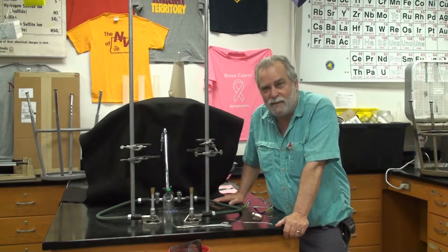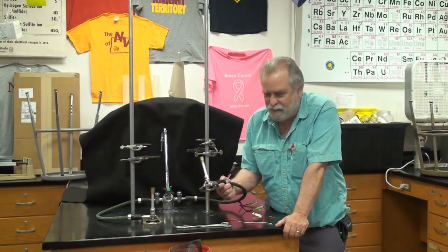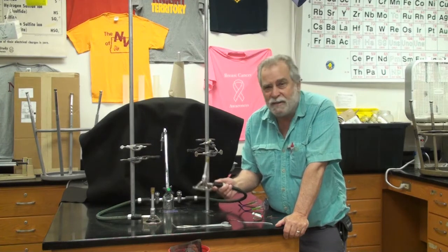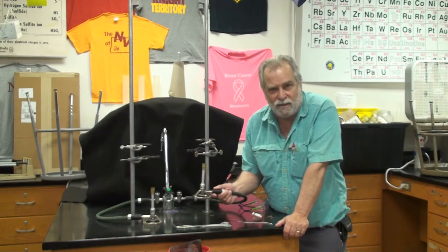Welcome back to chemistry. Today we're going to look at the Bunsen burner. So the Bunsen burner is this device here, and we'll use it to heat up different solutions or different chemicals to cause chemical reactions and so forth.